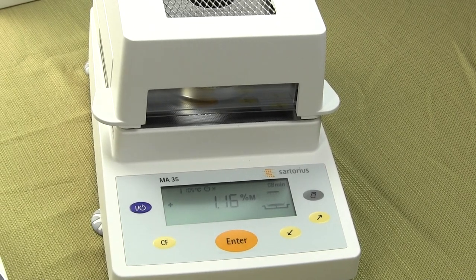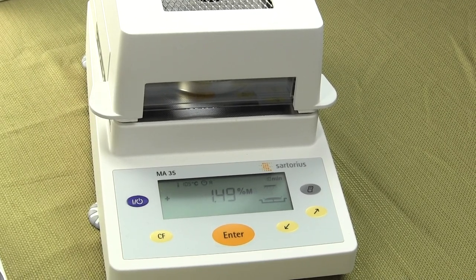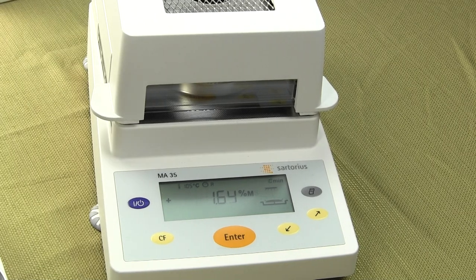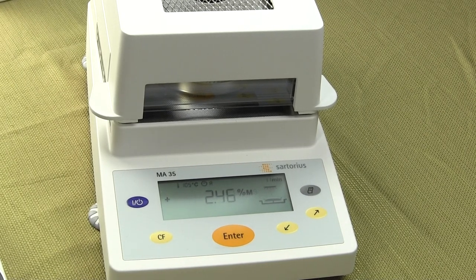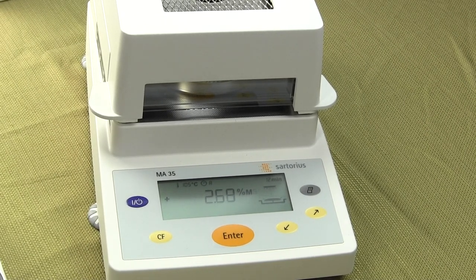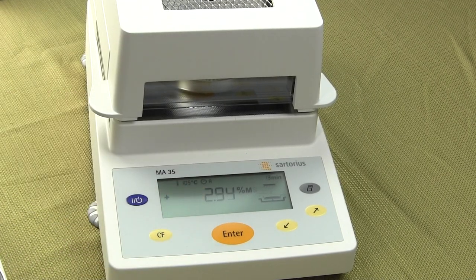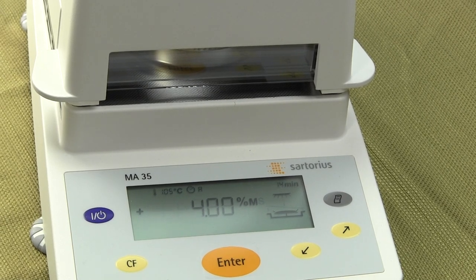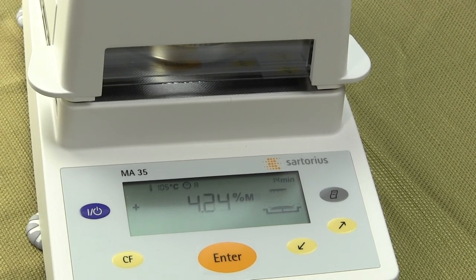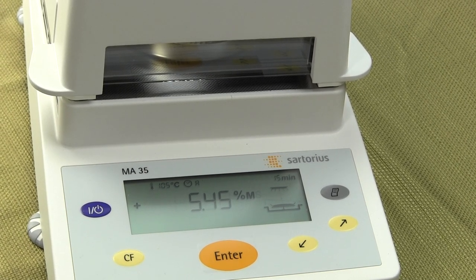There are some other moisture balances on the market that can go higher, but this one's max temperature is 160°C. In auto mode it's no longer necessary to program auto shutoff parameters — the MA35 continuously monitors the drying process. You can see the percent moisture being shown as the test runs. When the moisture balance doesn't sense any more weight loss, it automatically stops.